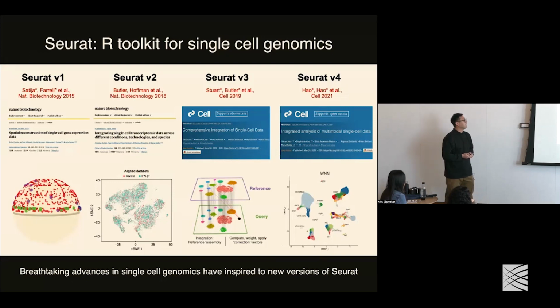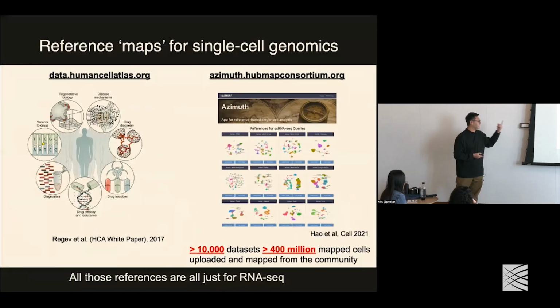Today I will also introduce the Human Cell Atlas, and we are pretty familiar with that. Right now, not just this, there are also other consortia like CZI and HuBMAP. We have a lot of atlases, and they have good annotations, not just at the big organism level. For different tissues, we also have high-quality annotations.